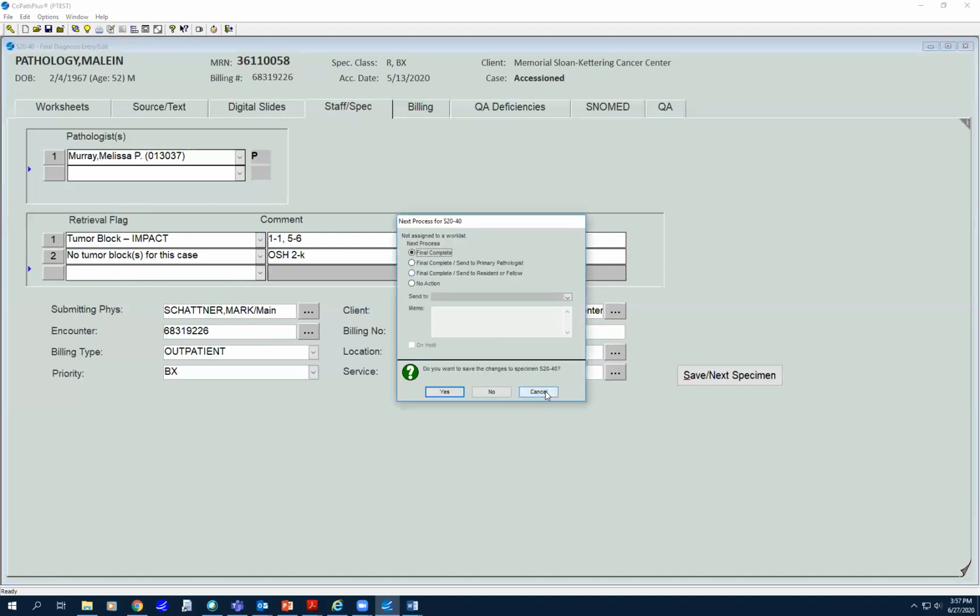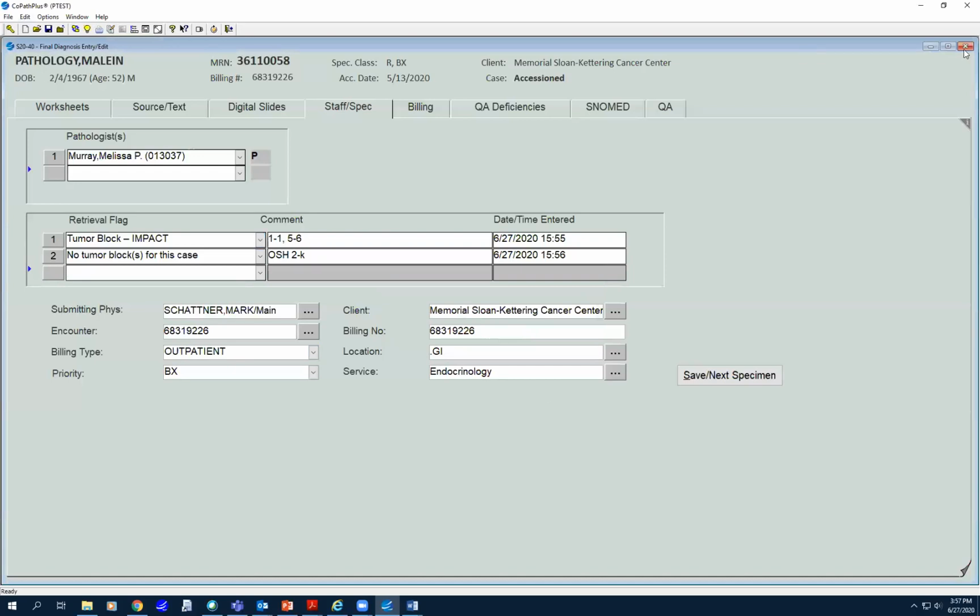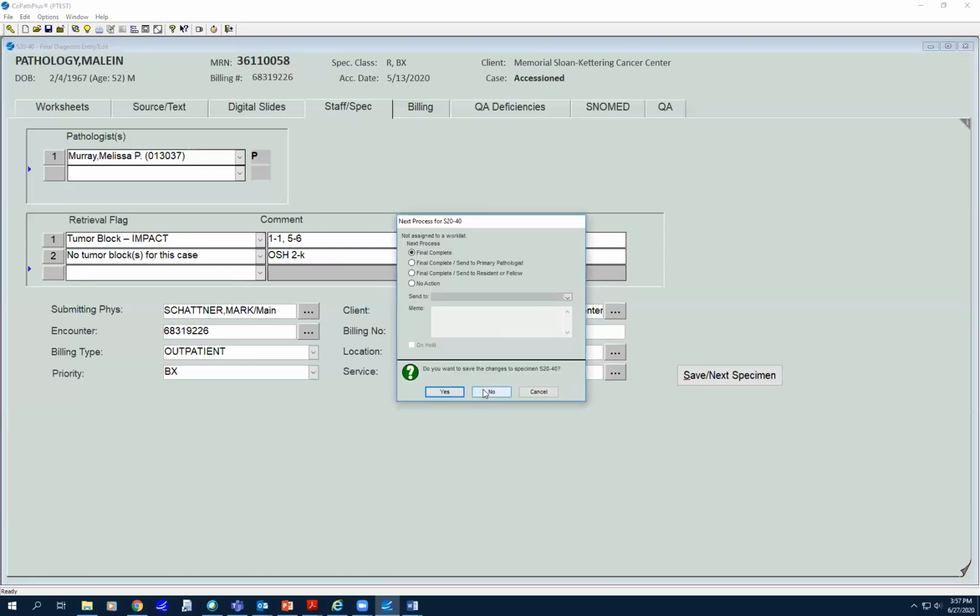I'm not going to save any of this. Oh, sorry. No.